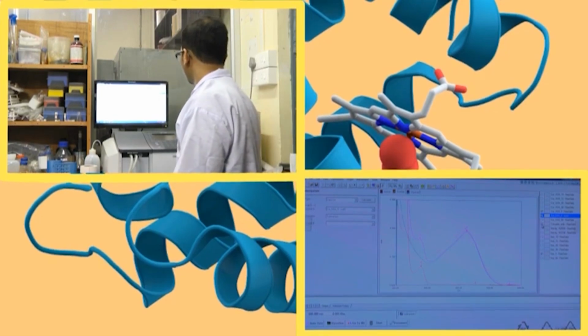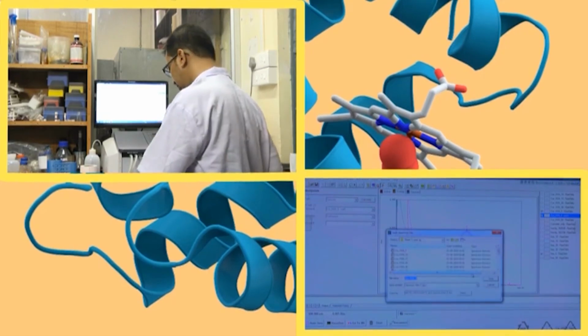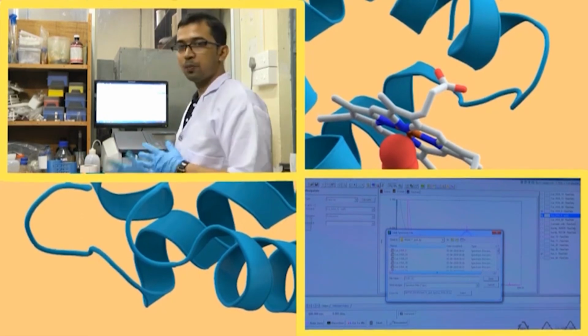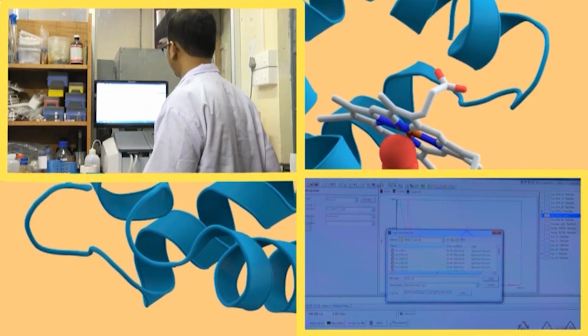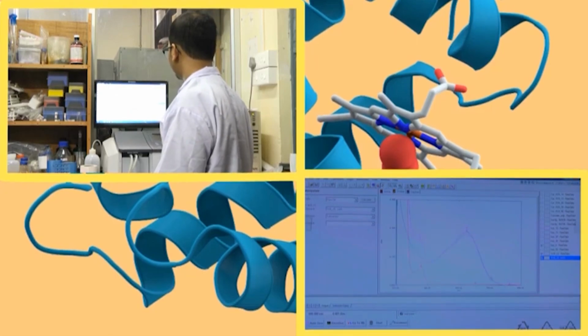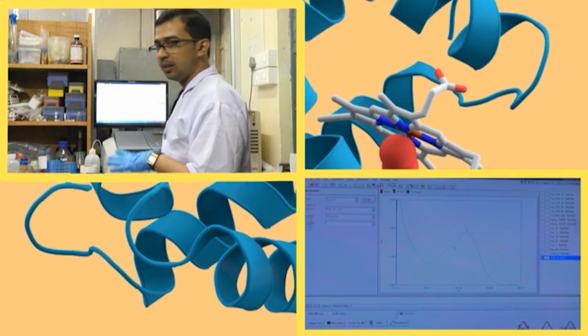I am saving this as SUB C5, which means subtracted curcumin for 5 micromolar of HSA. I am saving this again as a text file. Now I am turning this off. This is the subtracted file.